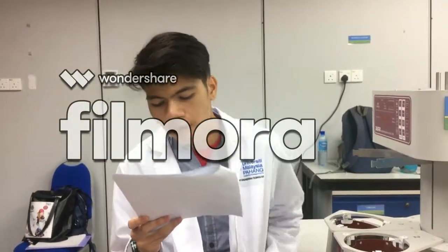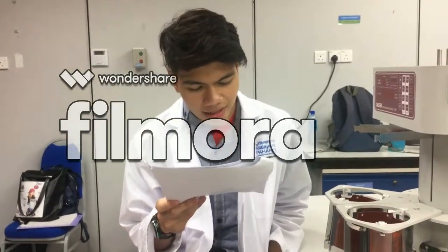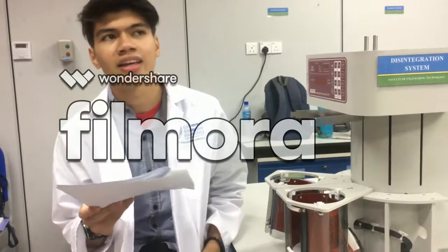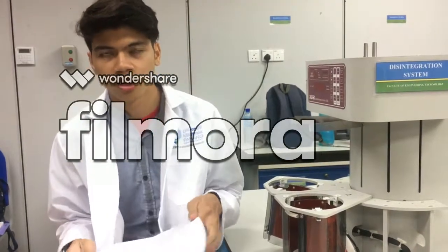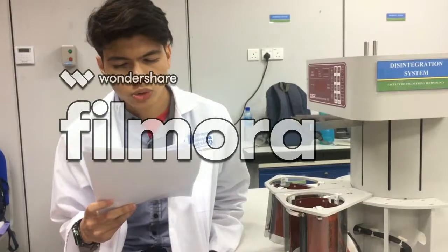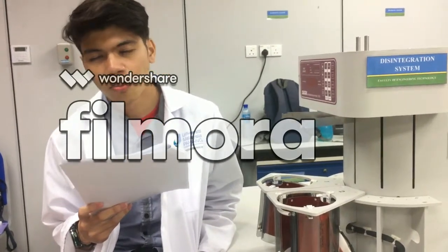This experiment is performed as a pharmacopoeial standard, and it is to measure the quality of oral dosage forms like capsule or tablet. It is performed to find out the time it takes for a solid oral dosage to disintegrate in our body.